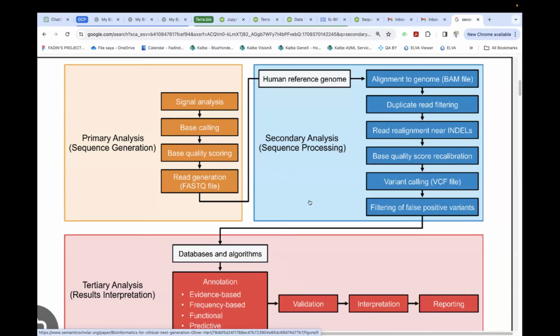Hopefully you guys are getting more familiar with bioinformatics and also with Terra, like Terra Bio, Nextflow, Snakemake, Galaxy project, and any other tools. These are pretty much the bioinformatics platforms that we use, but we have to understand first what is going on instead of just clicking on Terra Bio. It is much more than that. We have to understand what is going on on the bioinformatics side of the pipeline inside Terra Bio. That's pretty much it.